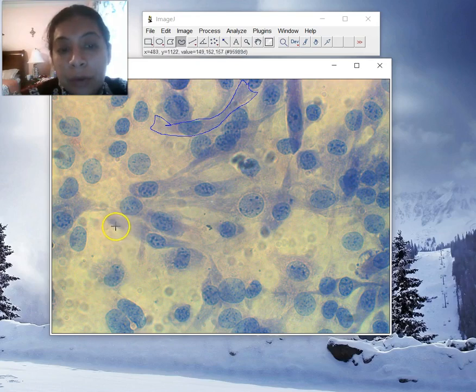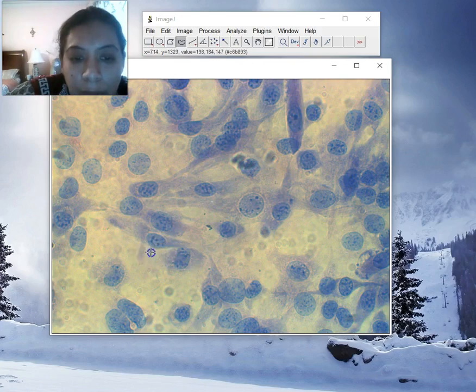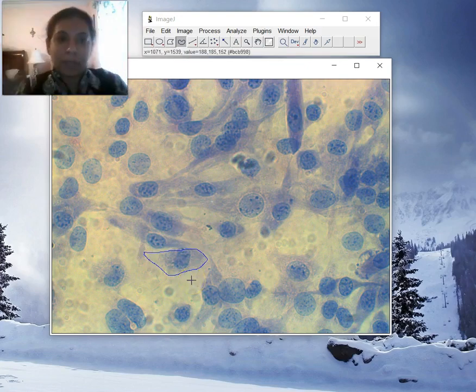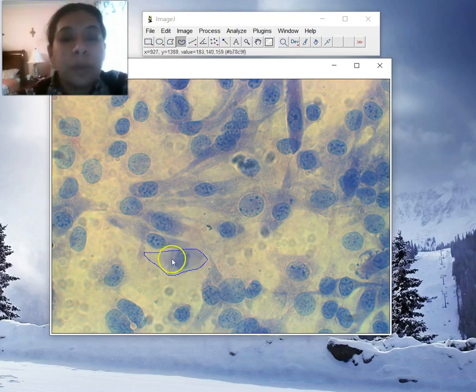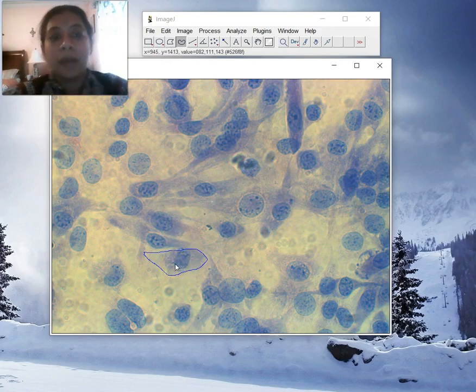And then if you look closer, you will see that there are other cells that are kind of on the borderline, right? So if you look at this one, for example, this was not a very good drawing from me, but this one is still kind of boxy, but at the same time, it does seem to be getting a little bit pointy on the edges. It's beginning to get that elongation, but we don't know where that would fall. So we maybe wouldn't know exactly which category to put it in if we just had cells that were completely undifferentiated and cells that were beginning to be elongated and showing signs of differentiation.